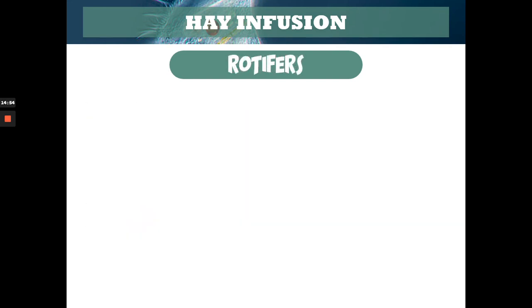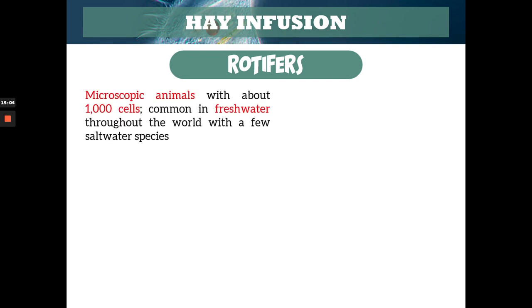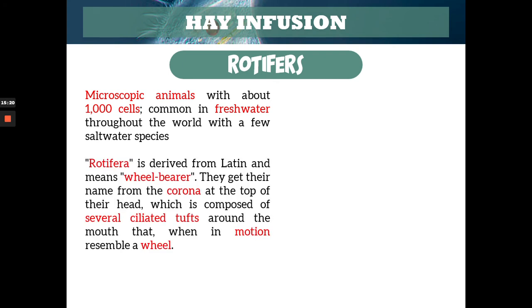The last protozoa I picked for us to look at that can be seen in the hay infusion is the rotifers. Rotifers are actually microscopic animals — not unicellular. They have about 1,000 cells and are common in fresh water, with a few in salt water. Rotifera — its name came from Latin meaning 'wheel bearer' because they have a corona, a crown-like structure at the top of their head with a lot of ciliated tufts. When in motion, it resembles a wheel.